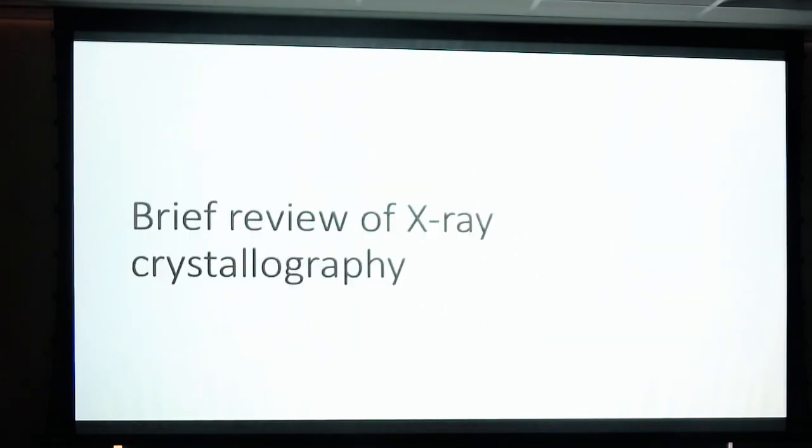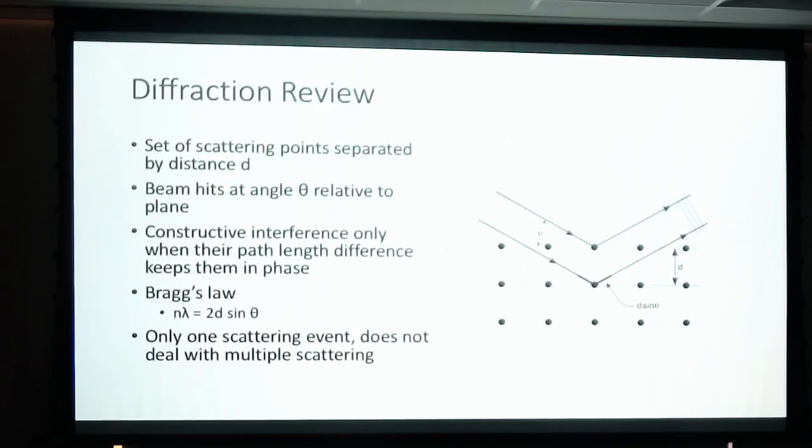So I'll segue a little bit into X-ray crystallography, because MicroED is very similar to X-ray crystallography, but instead of using X-rays, you're using electrons. I'm not going to go into very much. I don't know how many of you are crystallographers already? Some of you. Okay, so if you are, you'll know this very well.